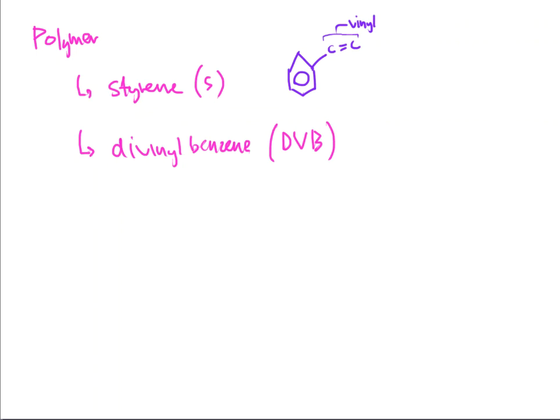Because if you take a look at the other polymer, it says divinyl benzene. Oh, okay. Well, what they've done is they've probably taken styrene, which is this benzene ring that has one vinyl group on it already, and they have put two vinyl groups on it. So there's my first one. Well, where's my second? I have an option. They're not going to go side by side. These groups don't really like each other because of that double bond. Those are negative areas, and negative areas are going to repel. So I could draw maybe one over here, right? Skip one, draw it there.